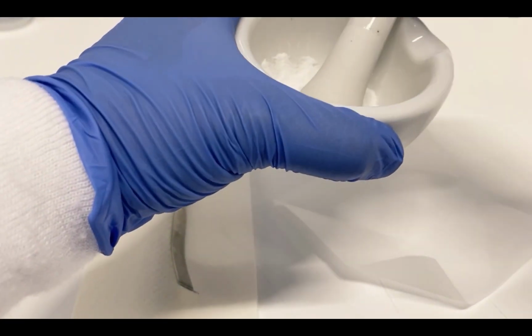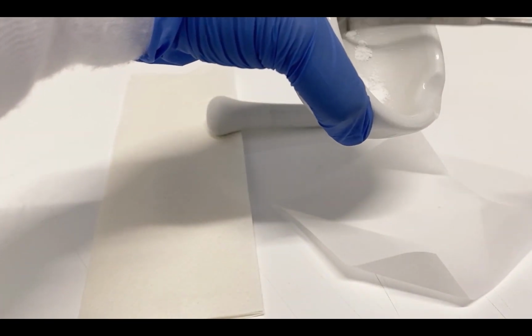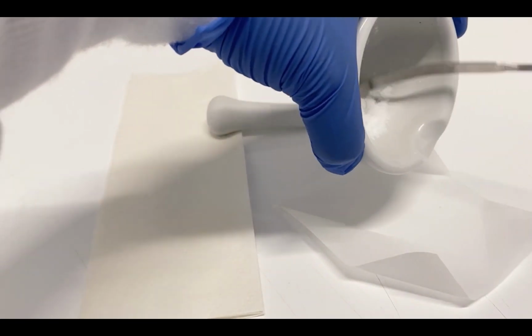Carefully transfer the mixture to the weighing paper and scrape down the remaining solid to get as much solid as you can.